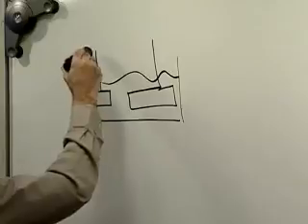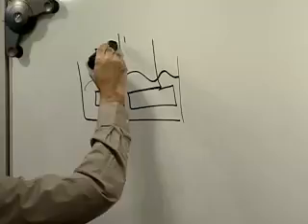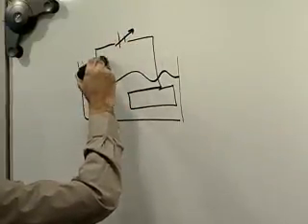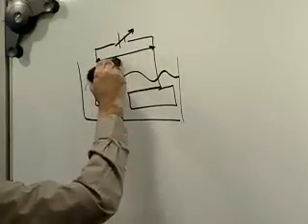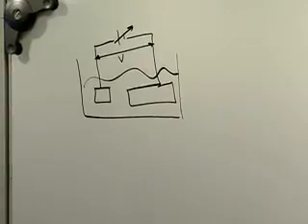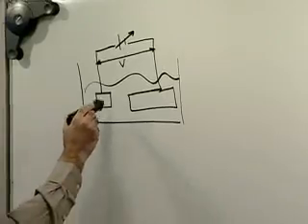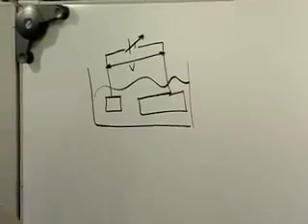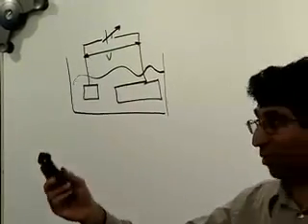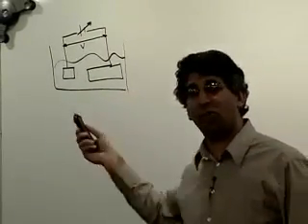And then you would take your power supply, and we'll give you a variable power supply, so you have a little knob on it. You can change the voltage, and you'll drop a voltage across your 2 electrodes in the hope that some chemistry happens, some electrochemistry happens. Now, if you are so fortunate that you have picked a molecule that, let's say we're going to be reducing this molecule, that can be reduced and it can only go to one thing, then this will work just fine.